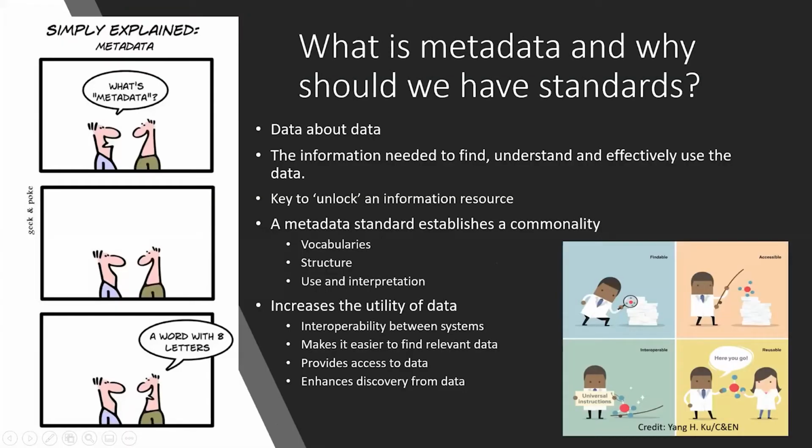So what is metadata? Quite simply put, metadata is data about data. It is the associated information that is required to understand and effectively use data, and it is a key to unlocking a resource. Metadata standards therefore establish a consistent way of structuring and understanding data to ensure proper use and interpretation. A metadata standard increases the utility of the data. It supports interoperability, makes it easier to find the data, provides access to the data, and enhances discovery from the data through its reuse.